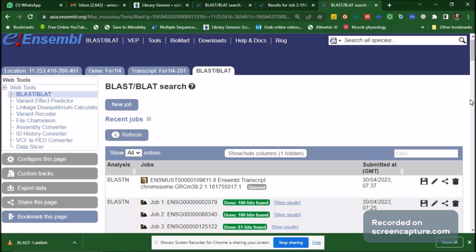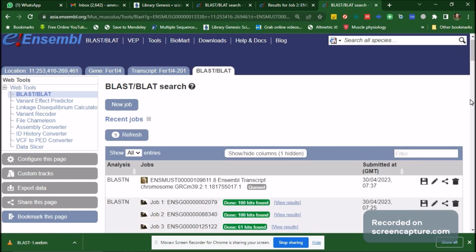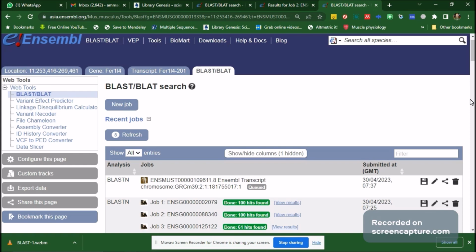Then it will be the real ortholog of our pseudogene which we were searching. So that is how reverse blast confirms that this is really the ortholog we were finding. Yes. So it's again running.